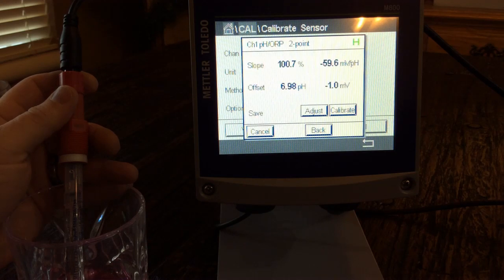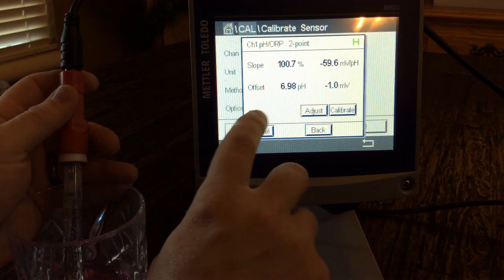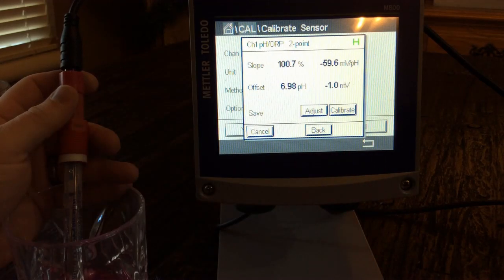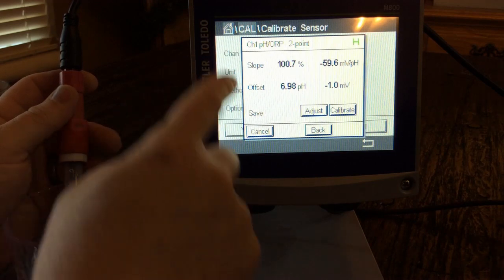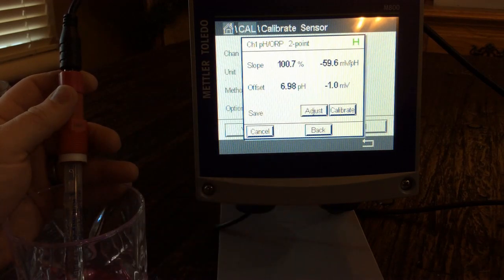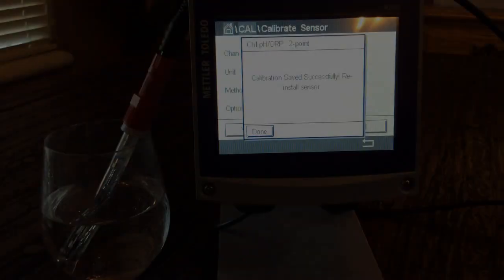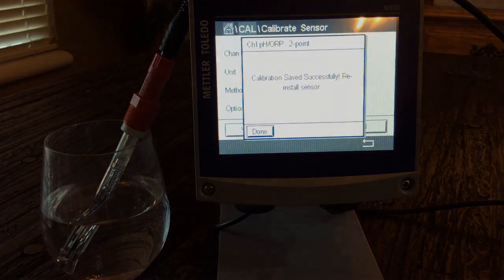It has found our 4 buffer and is calibrating to our 4 — actually a 4.01 Mettler Toledo buffer. Our calibration is finished. We can see our slope is 100.7 and our offset is 6.98. We have an adjustment to save. We can either adjust or calibrate — we want to adjust the sensor so it's adjusted to our slope and offset. We hit adjust, and our calibration has saved successfully.